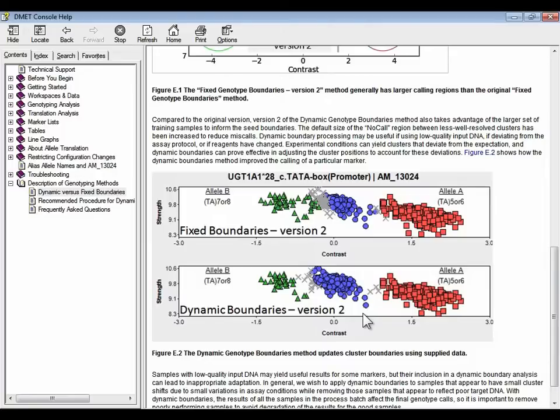The dynamic method may improve results. It may, for some markers, reduce the accuracy. It's one of those things that if you have data that you suspect would benefit from dynamic boundaries, you should try that method and then compare the results between methods.